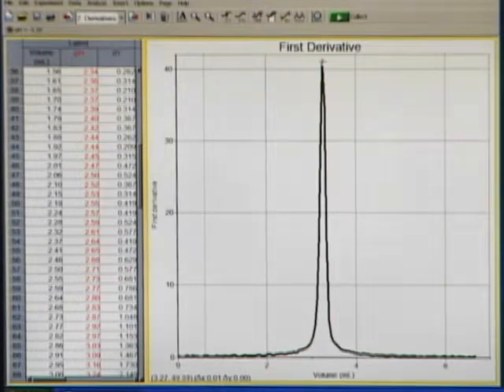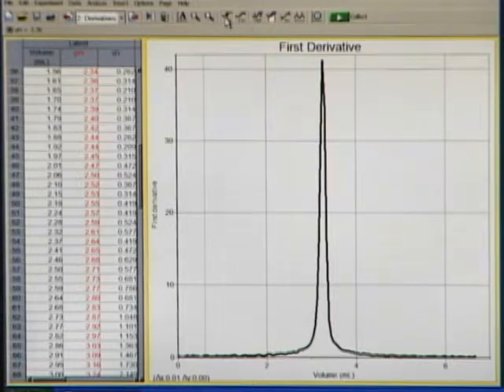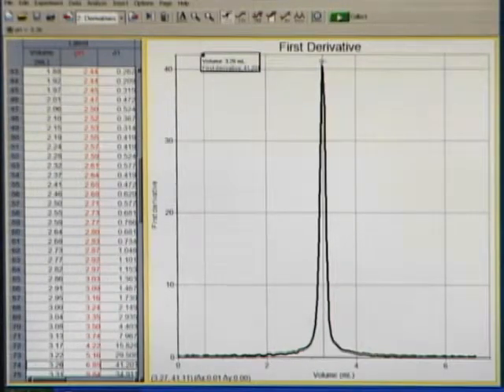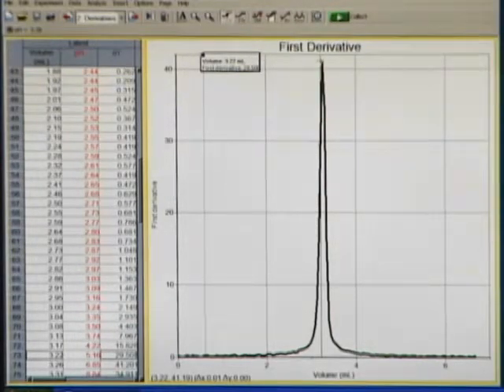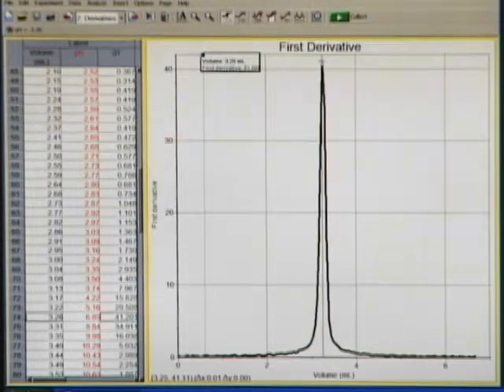The peak of this first derivative peak is going to tell us what our equivalence point volume would be. If I turn on the Examine button on the toolbar and come over here to the peak, it is showing us that the volume is around 3.2 milliliters for that equivalence point.